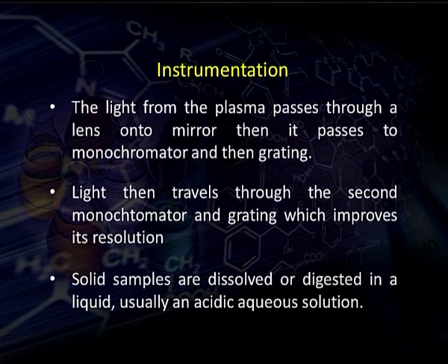Light then travels through the second monochromator and grating, which improves its resolution. Solid samples are dissolved or digested in liquid. Usually an acidic solution is used.